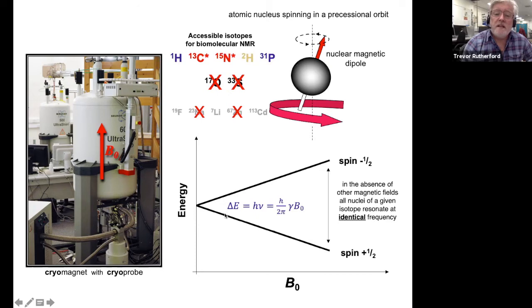So what we get is two different orientations, a lower energy state and a higher energy state, according to whether the spin is aligned with or against the magnetic field as an average. Okay. And certain nuclei possess this property, and they include the most abundant nuclei of hydrogen, which is the proton. The single 1H is just a proton on its own. So we use the terms interchangeably.